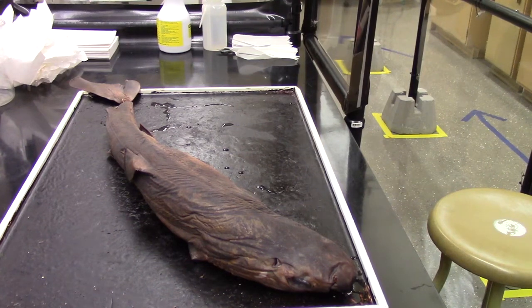Hi everyone, today I'm going to be showing you how to dissect a dogfish. Right here on the table I do have a specimen. I am going to go through just the basic orientation of the animal, and then I'm going to zoom in and show you each of the pieces kind of one by one. It is a fairly large animal, so it's a little more difficult to get the entire creature in frame while still being able to see adequate detail.